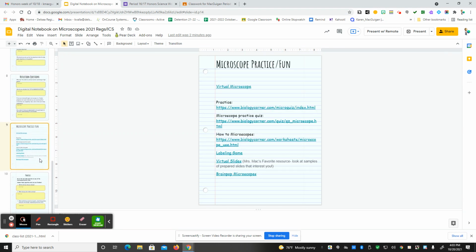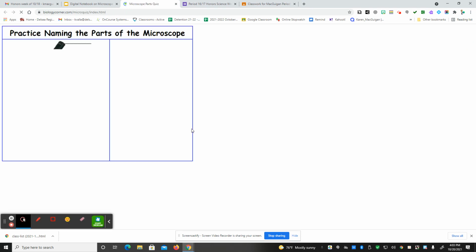So they're your questions. Now, the last part, which can take you anywhere from 10 minutes to 20 minutes to 5 minutes if you have extra time, depending on however much time you have left over. There's a virtual microscope lab that you can look at. I love these resources, which I'm going to open up for you guys.